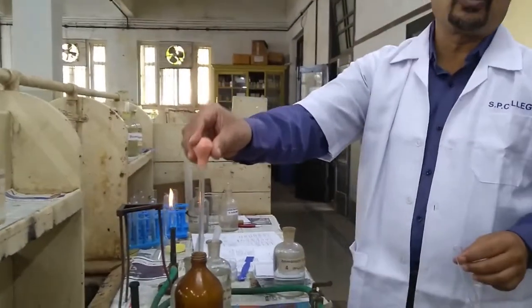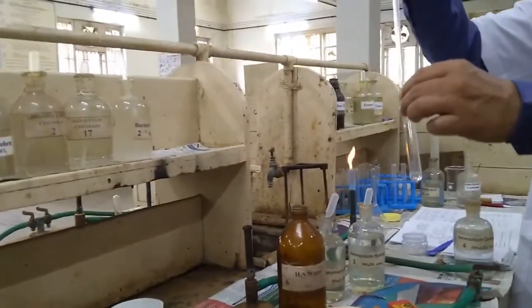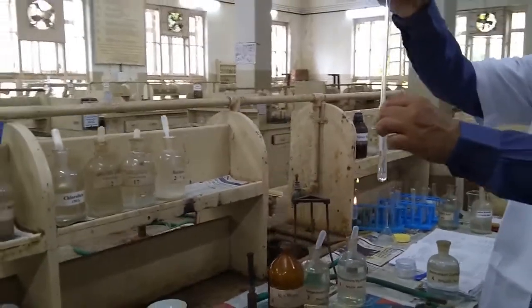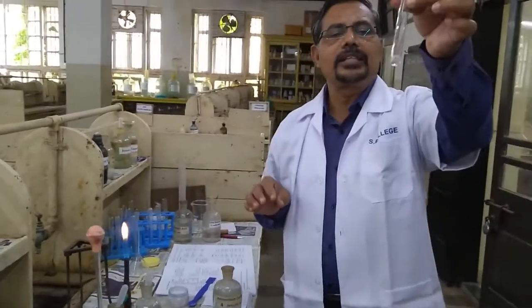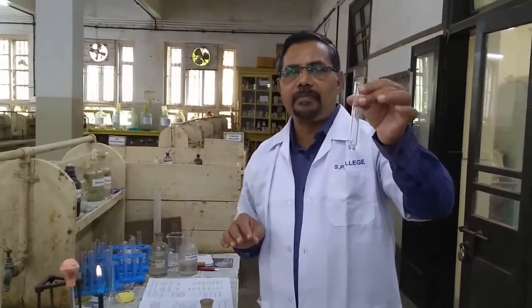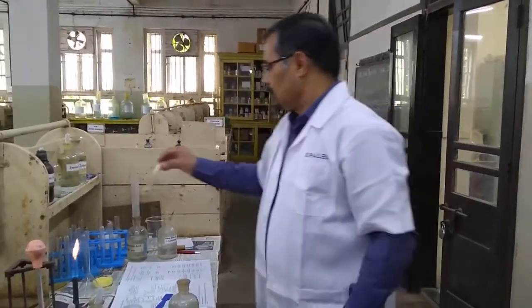The reagent for group 3B is alkaline solution plus H2S water. A small quantity of H2S water is added here. There is no formation of precipitate. Again the solution remains as it is, and that indicates the absence of group 3B radicals.